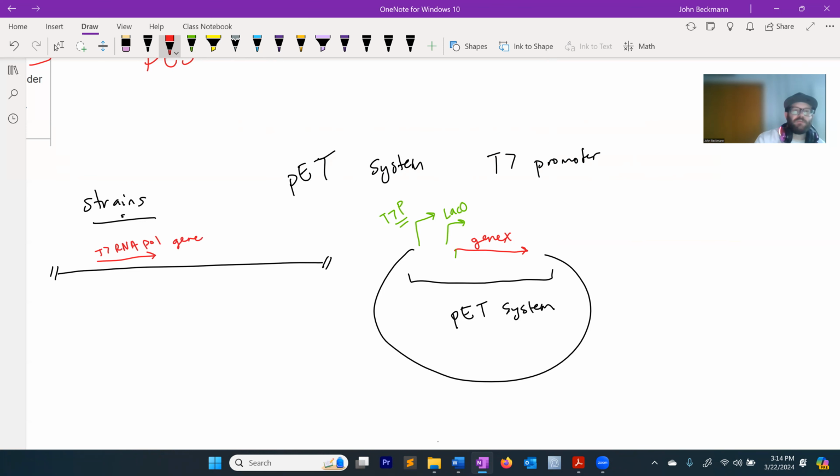And if you read the details of these insertions, usually they are regulated by a promoter which is also a variant of the lac operator. So in this system, there are 2 instances of promoters that are the lac operator. Okay, so let's go through what actually happens, and you'll see the unique features of this system.